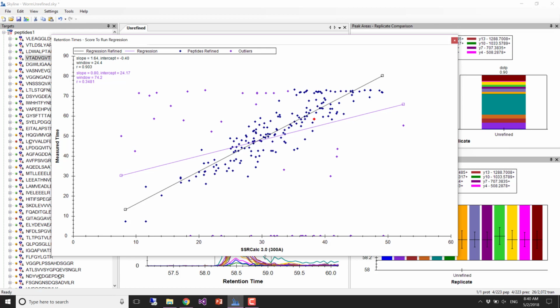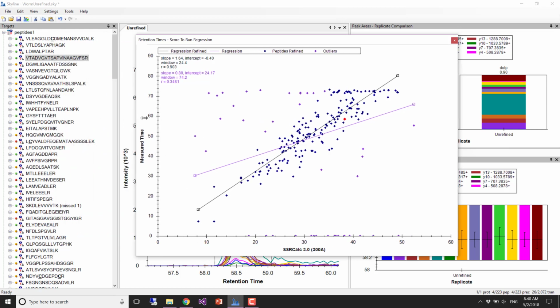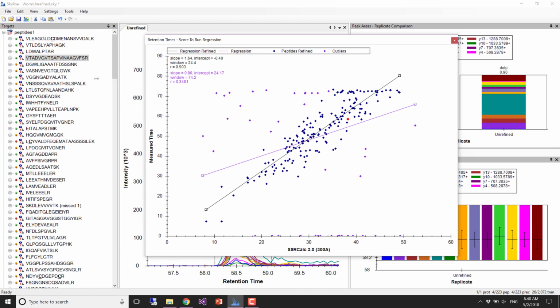So this is a regression. There's plenty of outliers here. But there's also some stuff on the x-axis. Do people know what the stuff on the x-axis is? Right, you see some points down here?